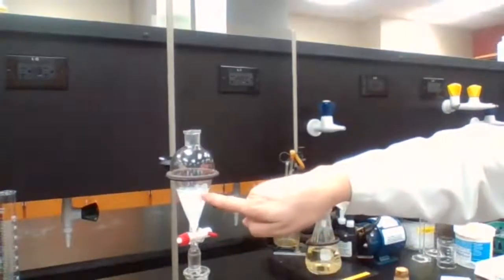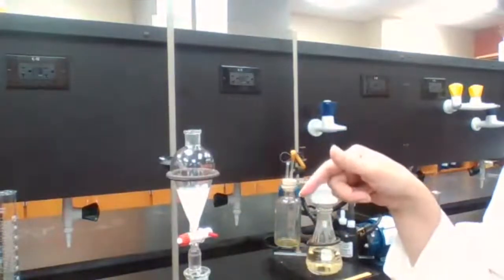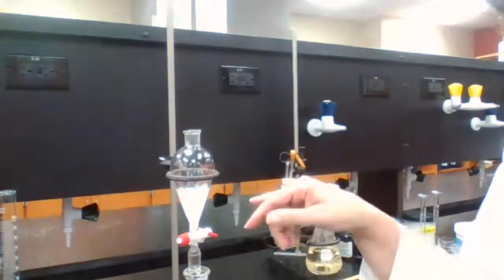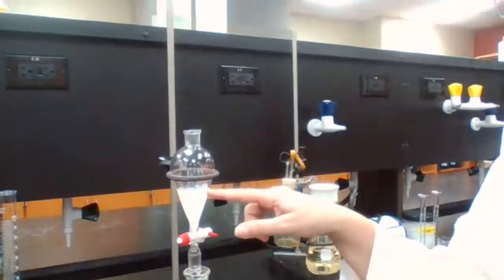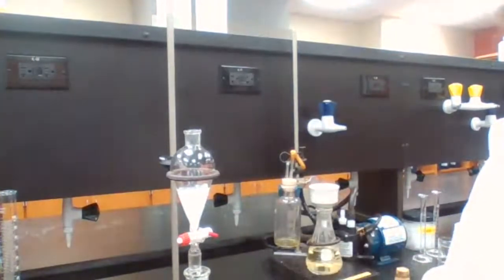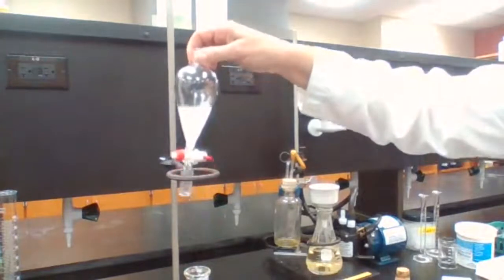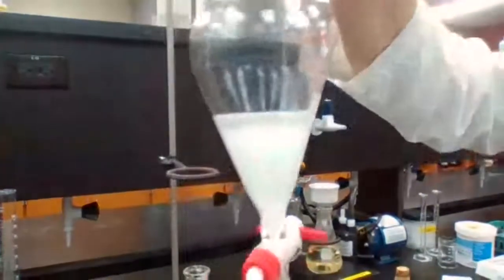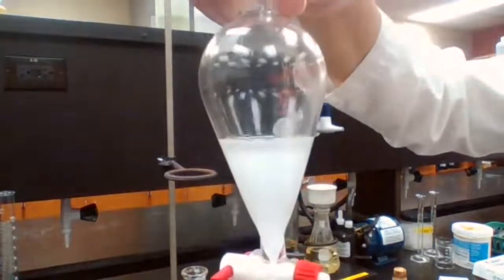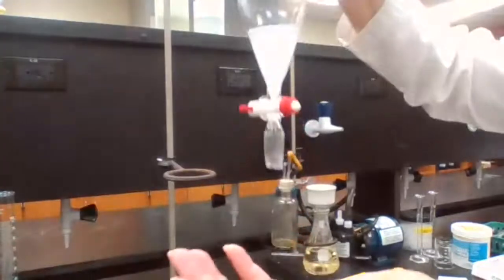So you see the two layers? The top layer is clear. Can you see it? Yes? Do you see the second layer, the oily layer on top? Sort of. Okay. What about now? I can't get any chemicals on my laptop. Can you see it better? Okay. Good.